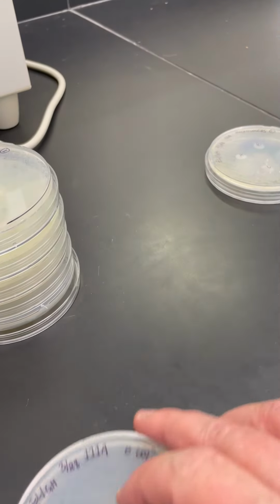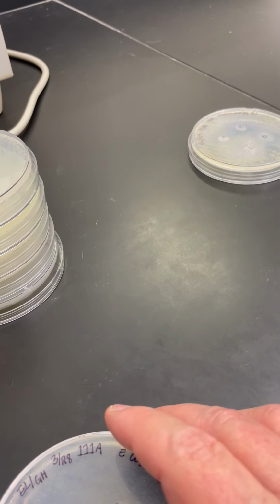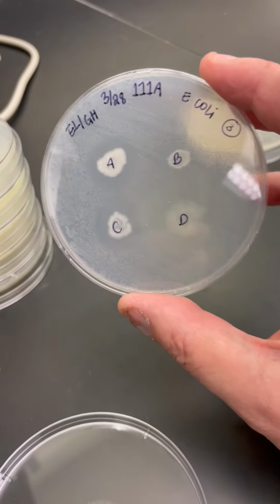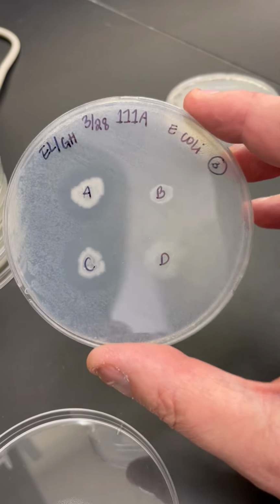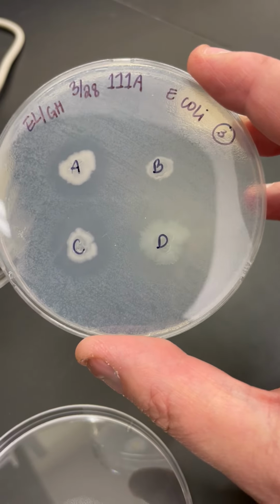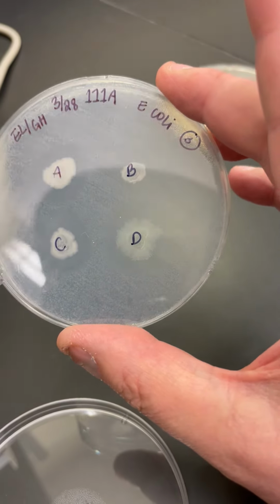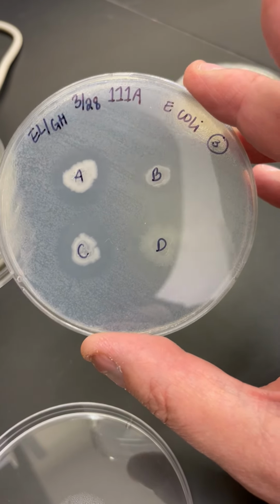The next one I want to talk about is E. coli. So we're seeing what A, B, C, and D do to E. coli, and look at that. It's very clear that, well, I would say A and C definitely, and maybe D. You might get better results on Friday.